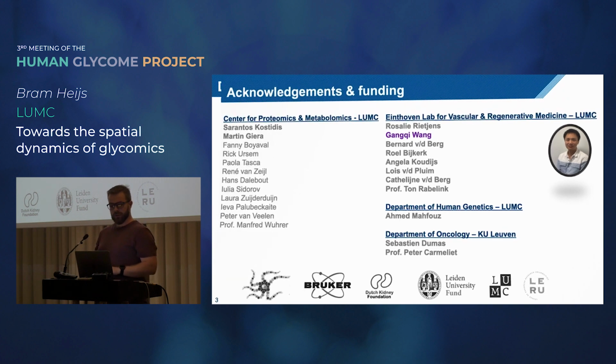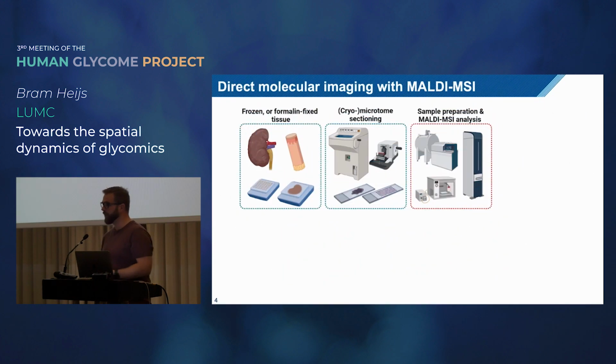So most of the work that I'll be showing you data on today is on direct molecular imaging using MALDI mass spectrometry imaging. And I was actually hoping for Rick Drake to be here to sort of pick out the hot stones for me and explain MALDI imaging, but I will do it myself, that's fine.